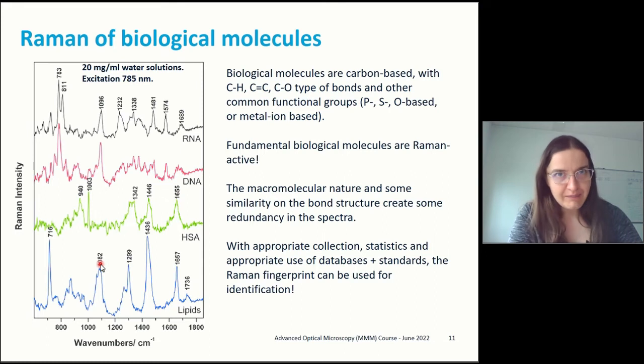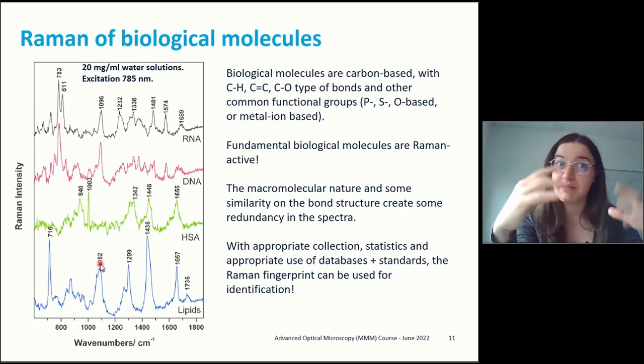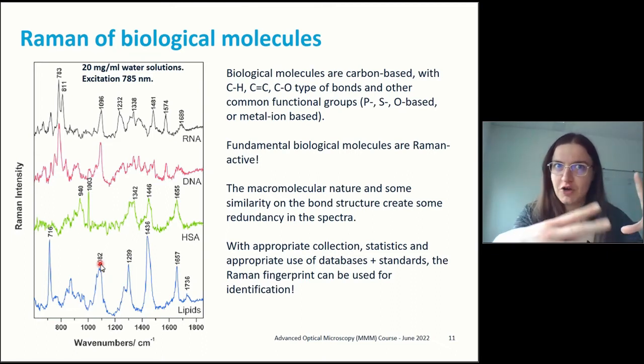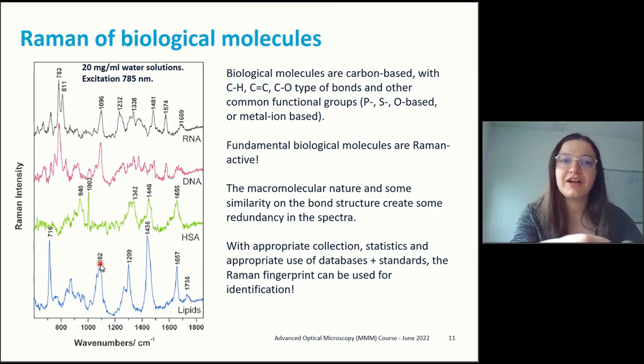What you care about is the fact that the bonds of these atoms actually tend to have a polarizability that is frankly fairly high. It's very rare that if you stretch a biological molecule around, the arrangement of the electrons in the bonds remains exactly the same, exactly symmetrical, which means that fundamentally biological molecules are Raman active.